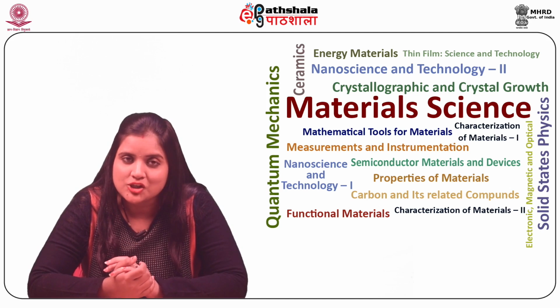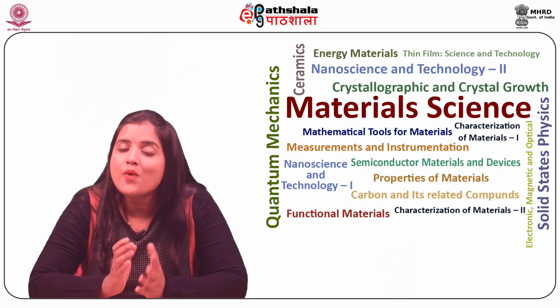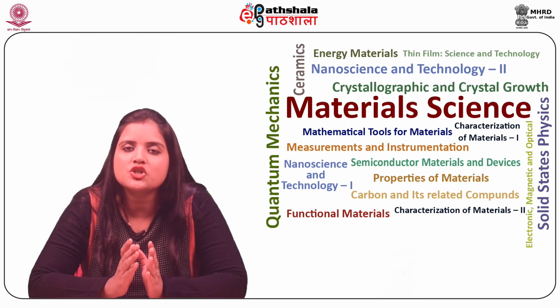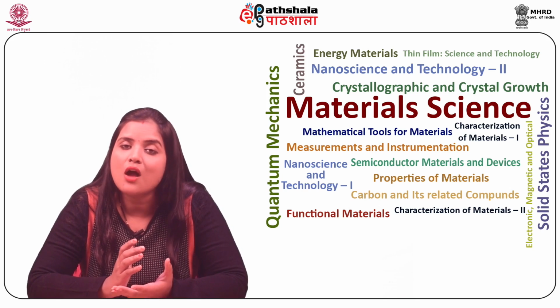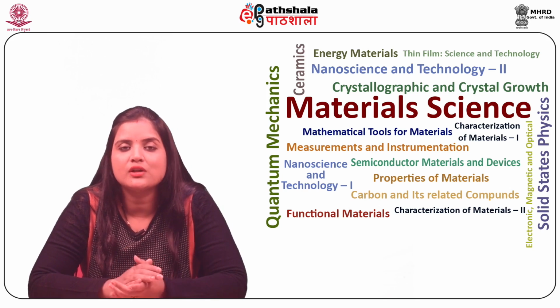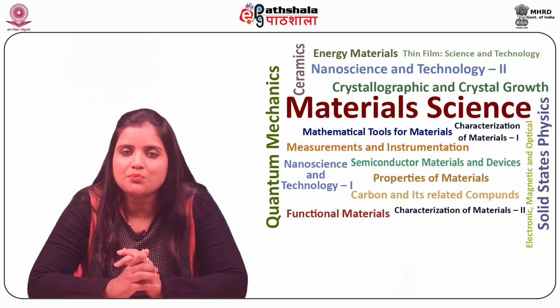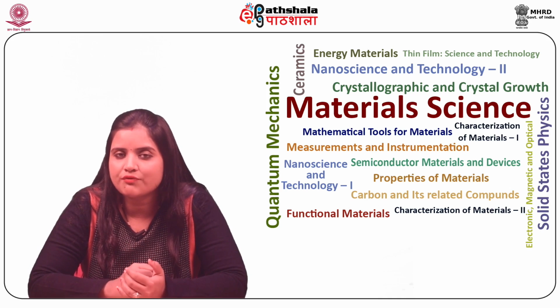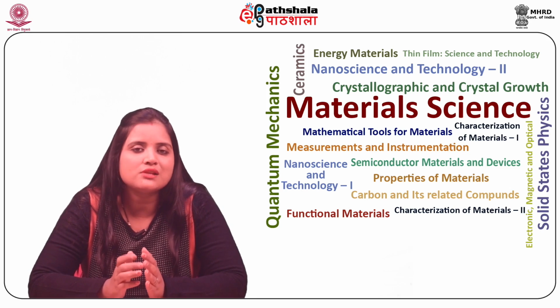Another important application of DHM is metrology. DHM facilitates accurate height measurements with excellent repeatability as well as good linearity without needing any vertical calibration. It has been employed for accurate positioning of mechanical parts, repeatability of interferometric piezo controller, motorized displacement, etc.